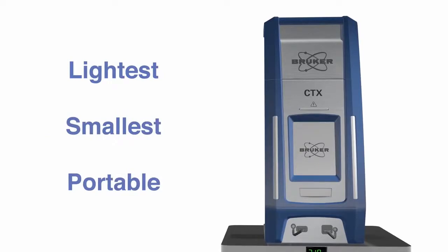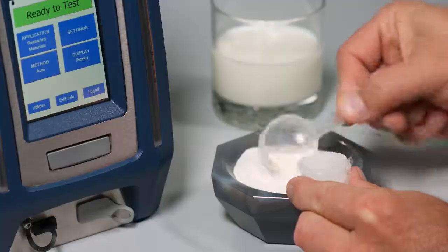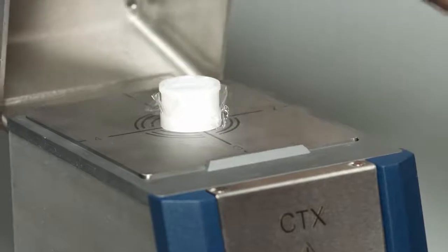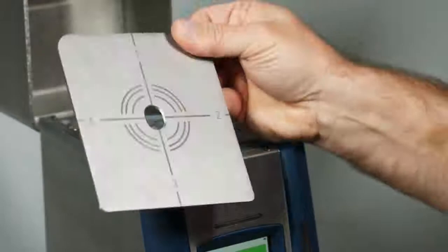It is the ideal battery operated and weatherproofed portable XRF for small samples, prepared samples, and those presented in cups, bottles, and bags. The CTX is equipped with a convenient sample plate with marked guides to improve reproducibility of sample placement.